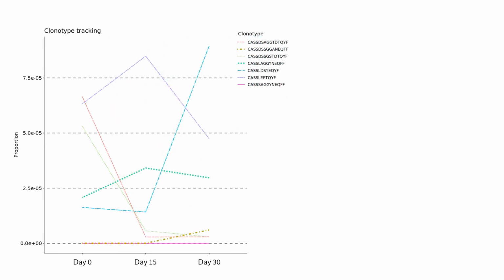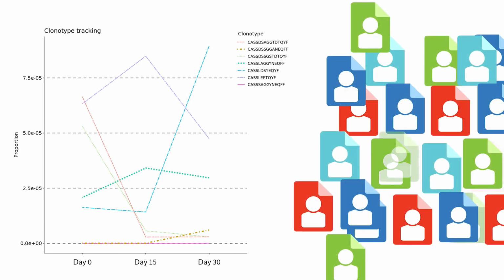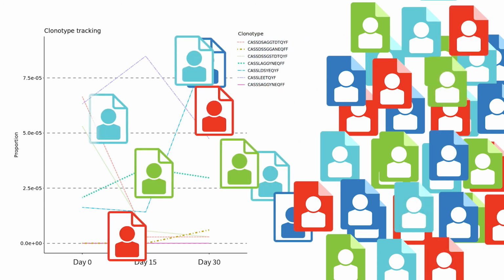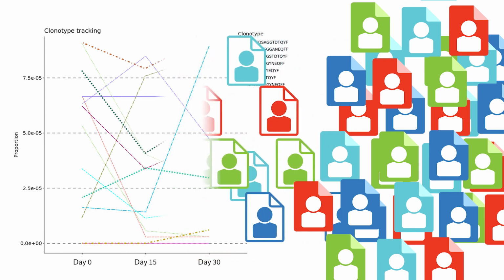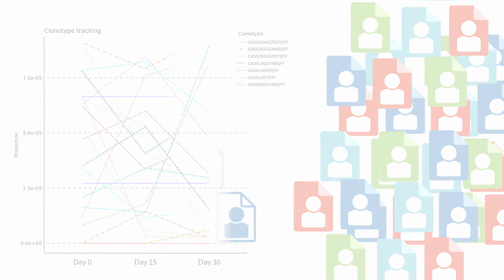This analysis can be applied to a large cohort of individuals across multiple studies, allowing multiple iterations to gain additional insights. Data can be added continually to enhance the analysis and interpretation of your results. Compare clonality over time in a cohort of individuals with the same treatment.